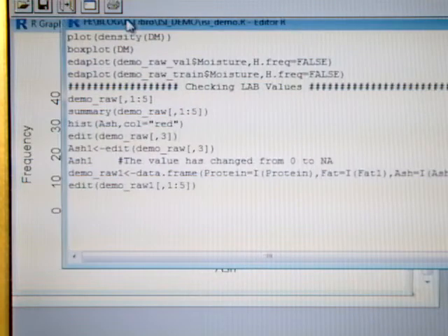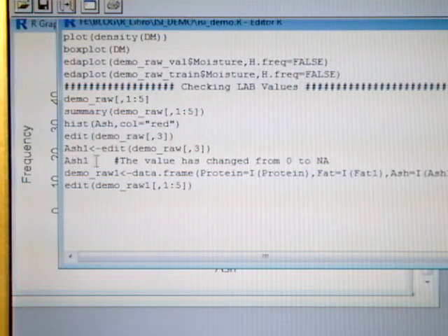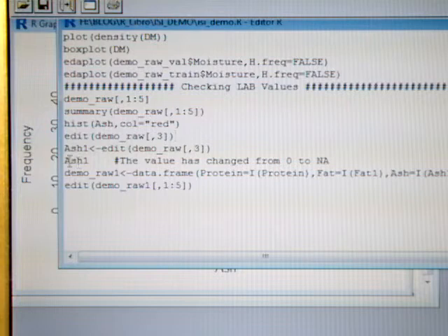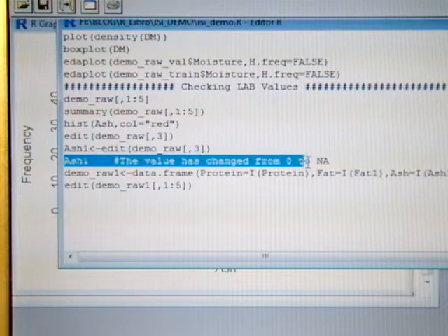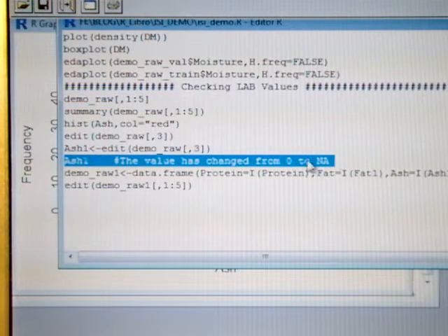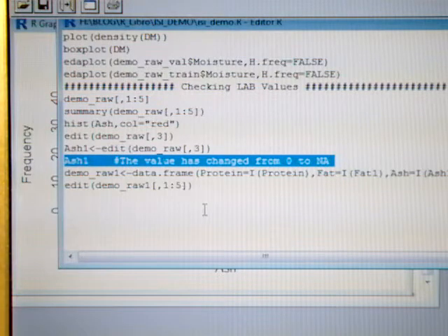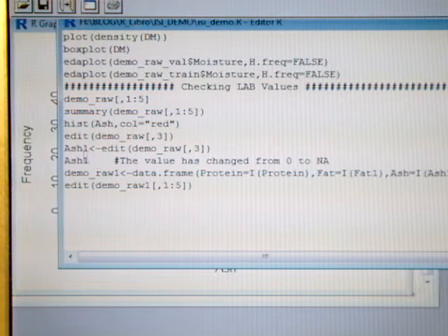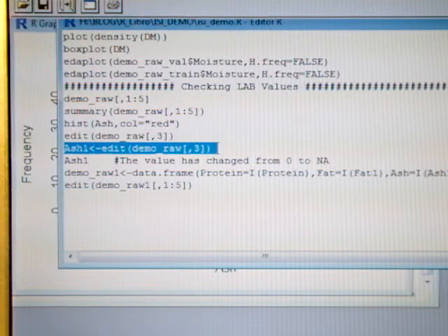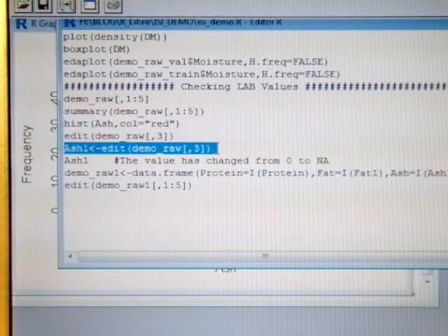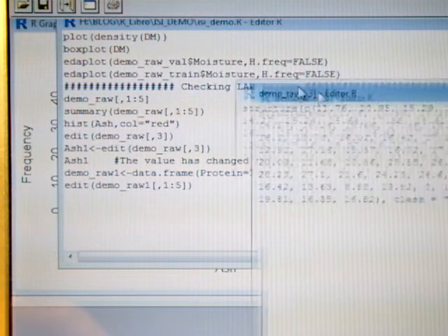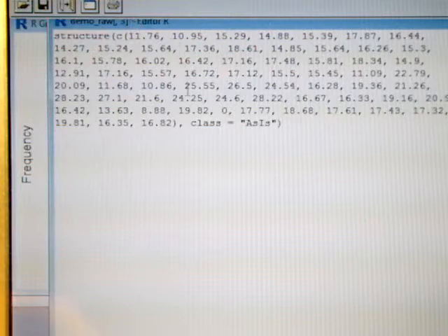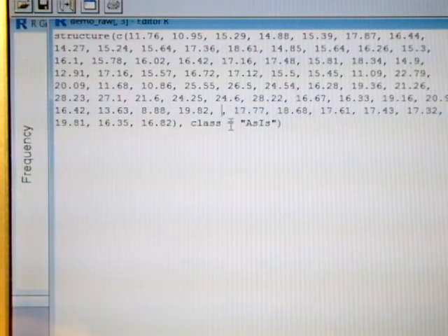Now we want to change the 0 values for the NA character, so we are going to do it for ash and to create a new constituent ash1, where the value change from 0 to NA. So let's edit ash and we are going to change the value, so we change 0 for NA.